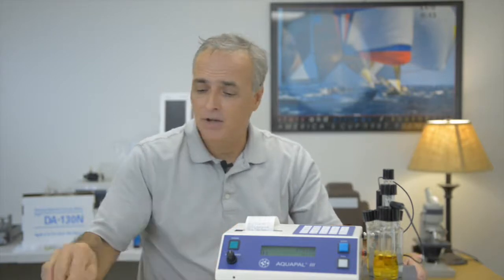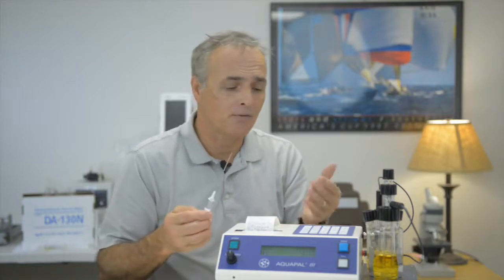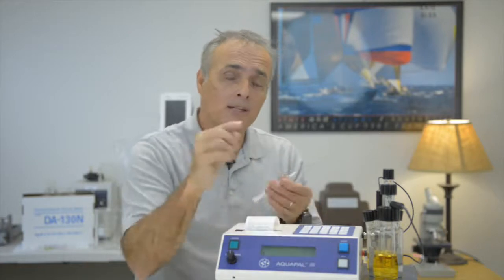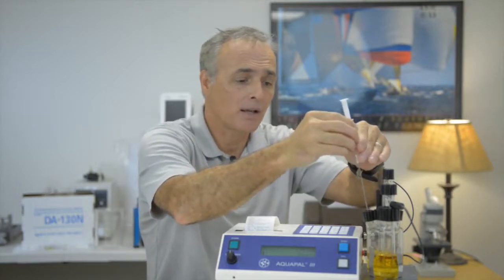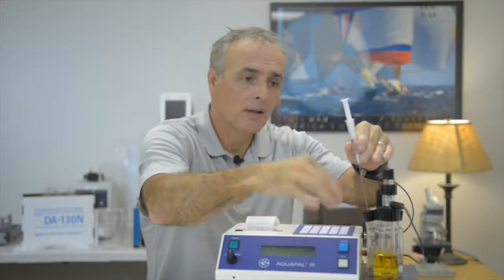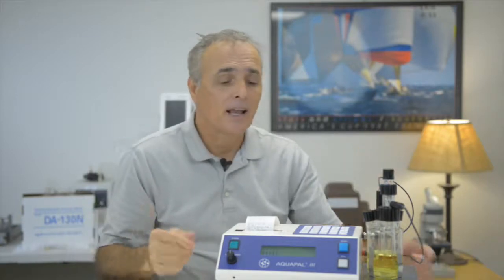Now, here's the key. We're ready for another test. Do I need to enter any other additional information, ppm and V over SG? No, I don't. All I need to do is press the start button and inject my sample. I have a 6-second delay to inject the sample. What I typically would do is get my needle ready, then press the start button, and then inject my sample, and the second test is now underway. Again, all you have to do once you set the parameters up is press the start button and inject your sample. No need to re-enter those.